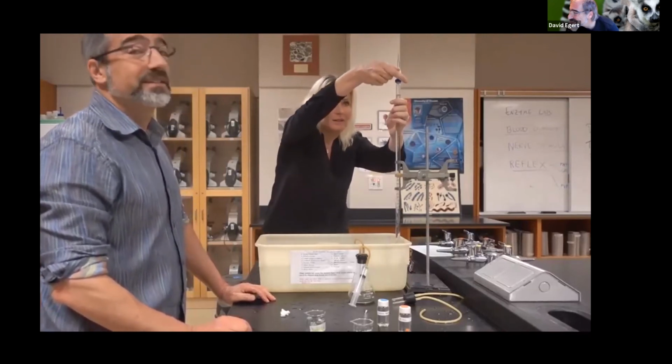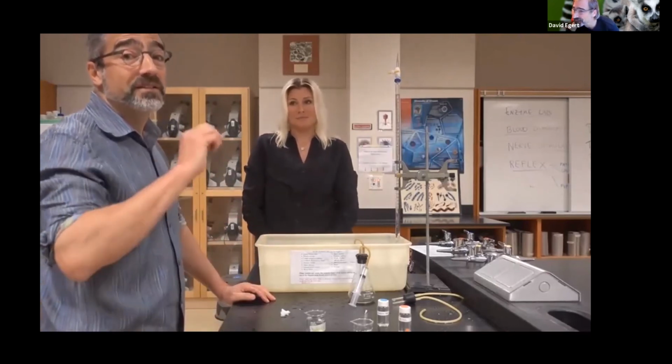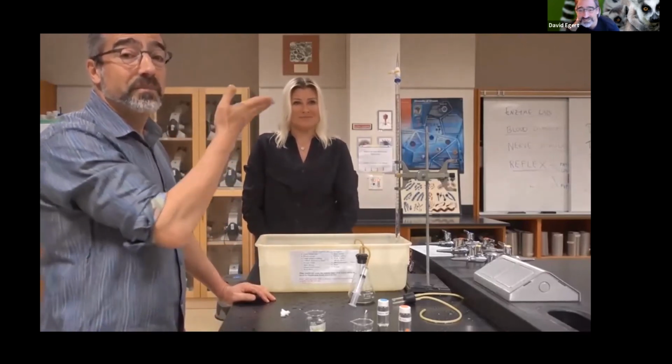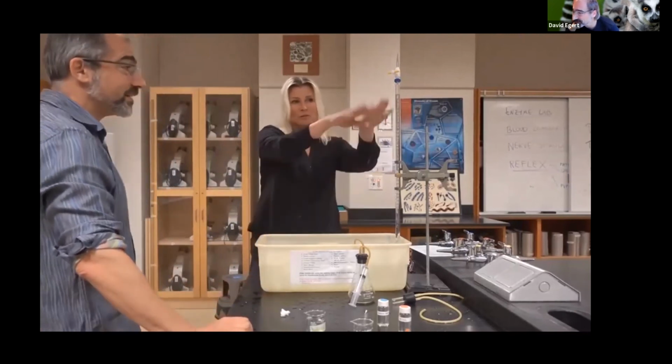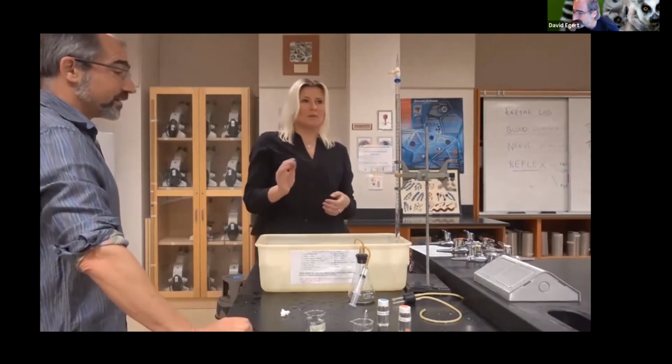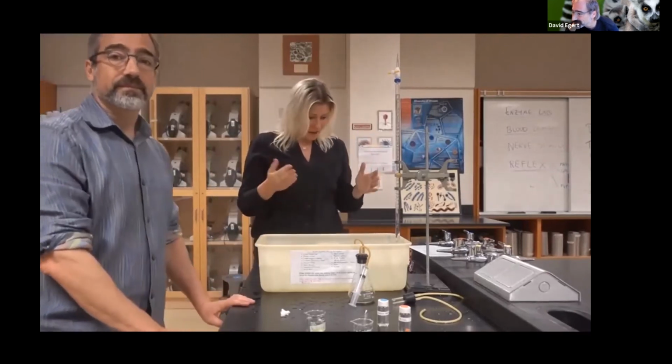There. And this is not quite always as easy as she makes it look. There's kind of this delicate sweet spot, but once you have practice, you'll be able to do that. All right, so if you go lower, then refill the burette and set it up again. All right, so we're ready to go now.